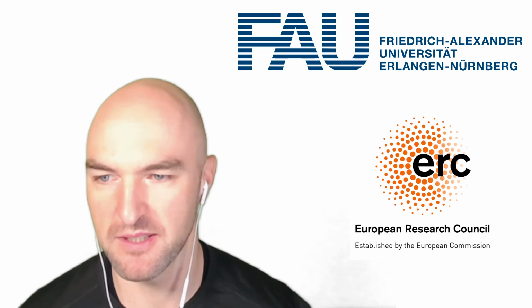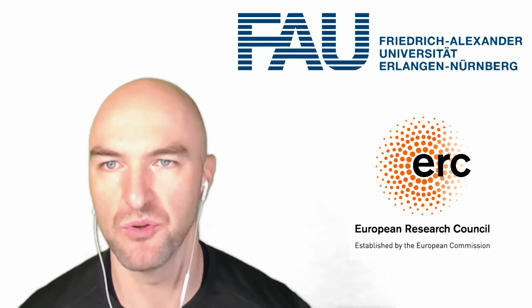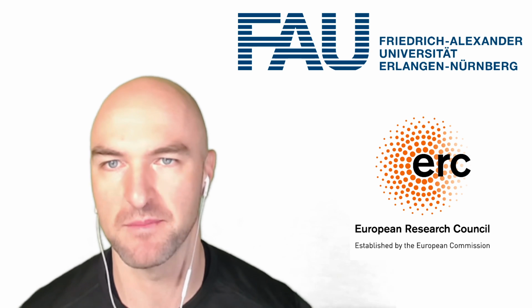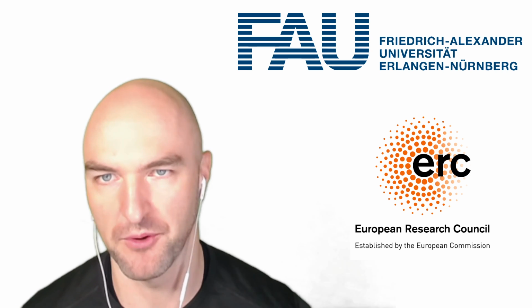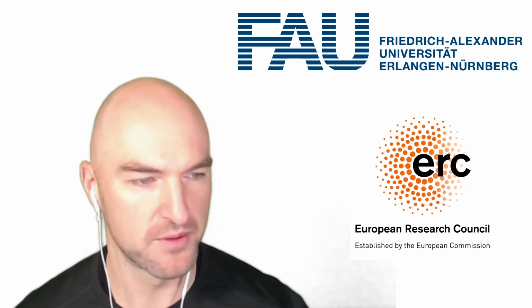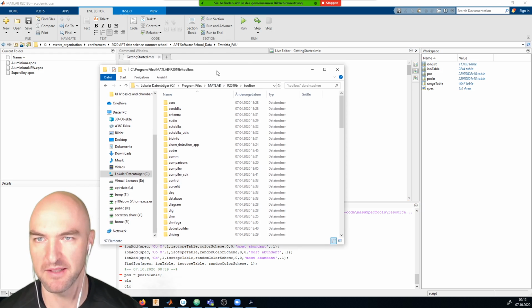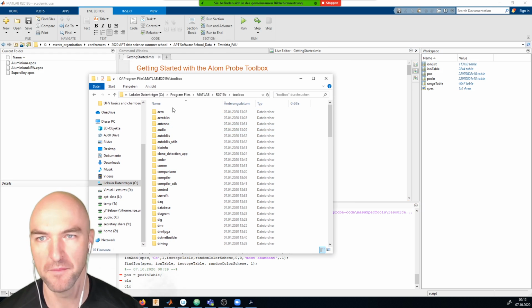If you want to see the contents of the toolbox, by the way, you can go into your program files, Matlab, release, whatever release you have. I hope you have. Oops, I forgot to switch over to here, but I guess you all were able to install it. It's not a very difficult thing to do. And then here you should have all your different toolboxes.